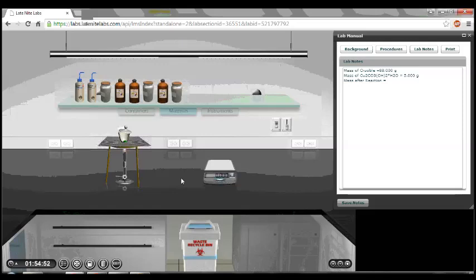And it has. All right, so now it's turned black, and there's mist coming out of the crucible. So we're going to move the crucible over to the balance to see how much it weighs, and lo and behold, we actually lost some mass, 91 grams approximately. And that mass that we lost is now in the form of vapor, which escaped the crucible into the virtual lab setup, and that in turn is what a decomposition reaction is.